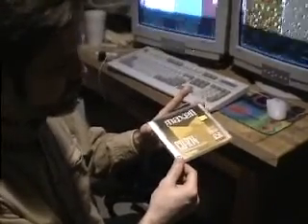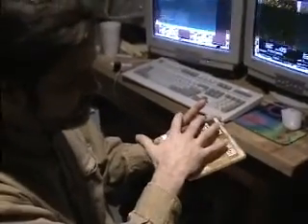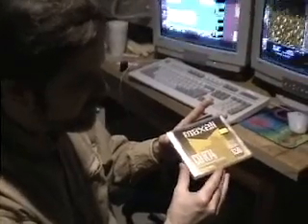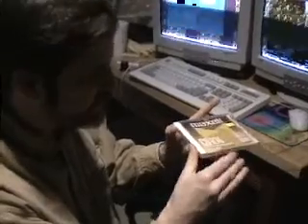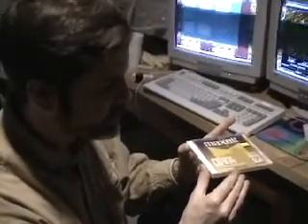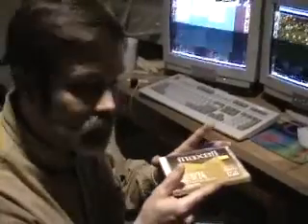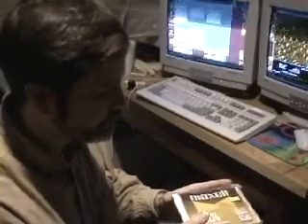That's not of any scientific interest at all. So what we would like to do is accumulate a whole image, have the computer look at all the data on the whole image and fit the best plane to it, and then correct for this tilt so we get a level-looking image where the changes in topography are physically meaningful. That's what it does for the offline plane fit. So that's what it does in order to save an image. It accumulates the whole image, does the plane fit, and saves it in that format. And if you wanted to, you can turn that off, but there's no reason to want to.